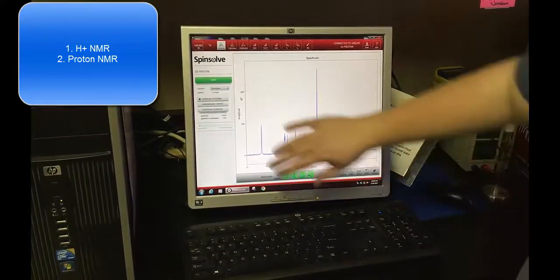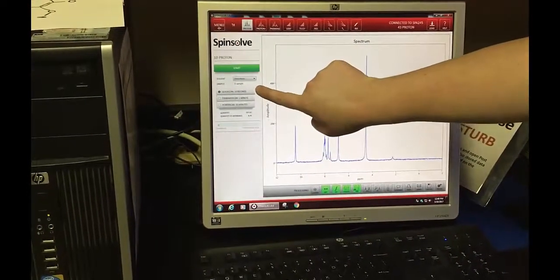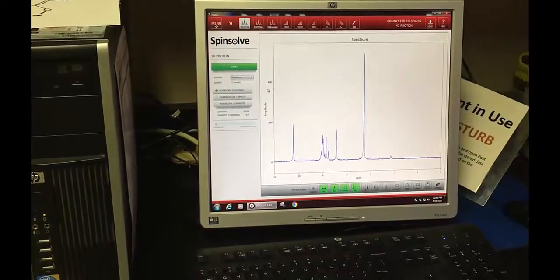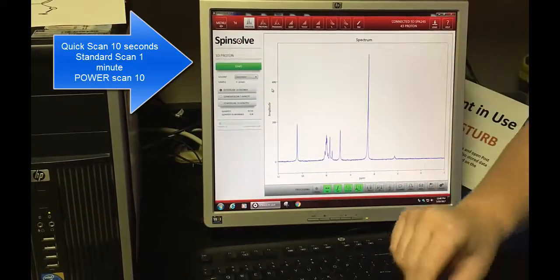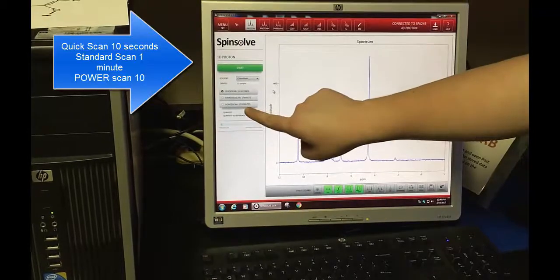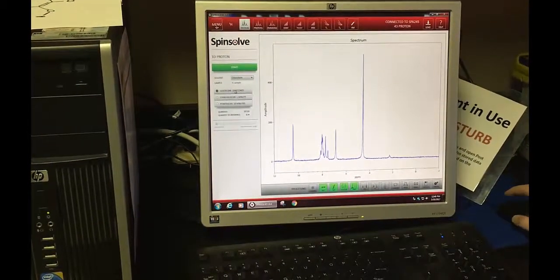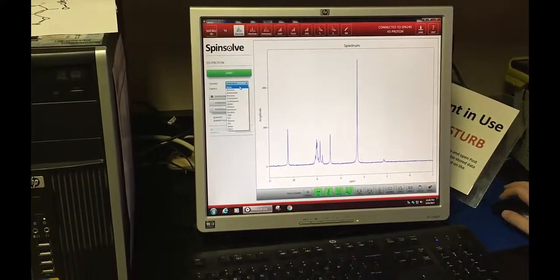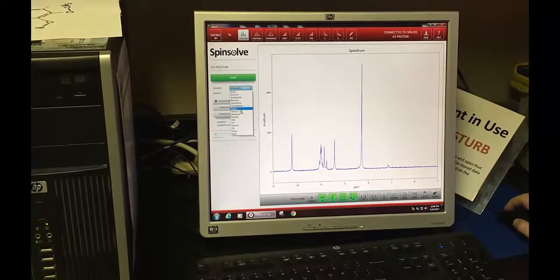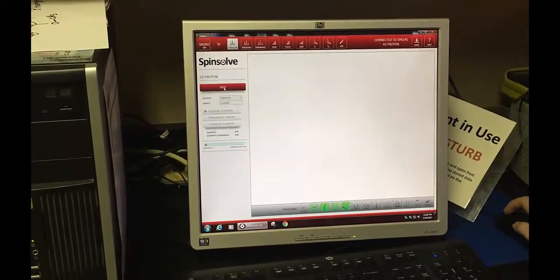So it comes up with this, and over here you have several different choices. There's the quick scan of 10 seconds, which will give you a really quick, fast spectra. If you want really sharp, clear peaks, then you're going to run a power scan of 10 minutes. Today, I'm going to run a 10-second spectrum. You're going to name your sample and choose which solvent is in your sample. So I have chloroform, and then I press start.